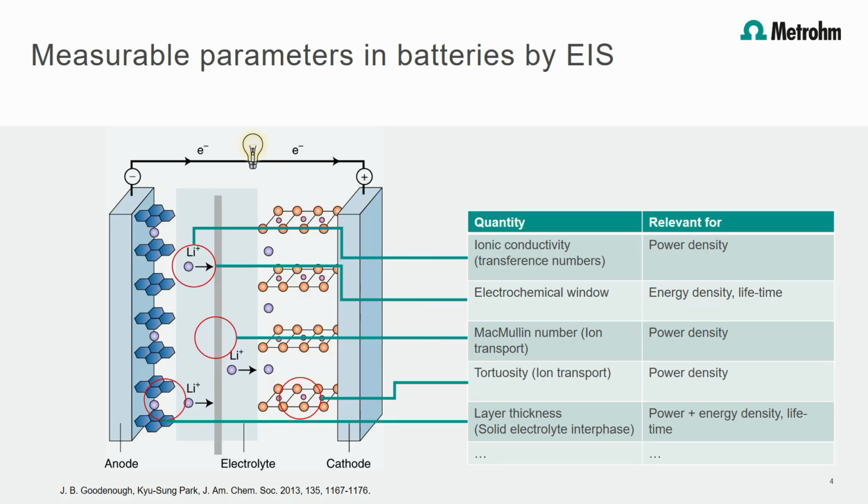So what can be measured with impedance spectroscopy? Or in other words, why is impedance spectroscopy such a valuable tool for battery researchers? Because the total battery, its components, and the occurring reactions inside the battery can be examined. Here are a few examples.